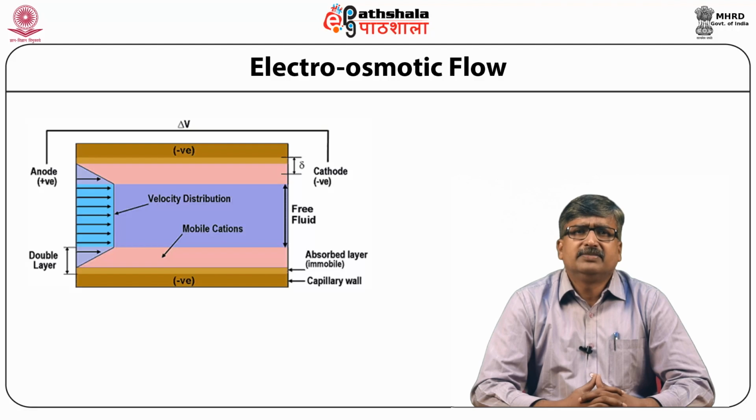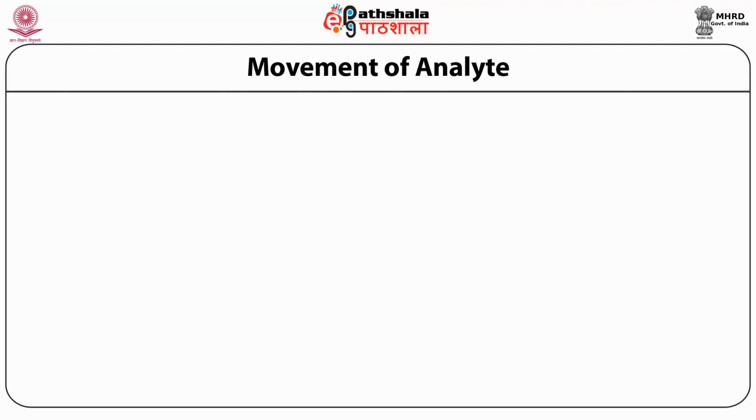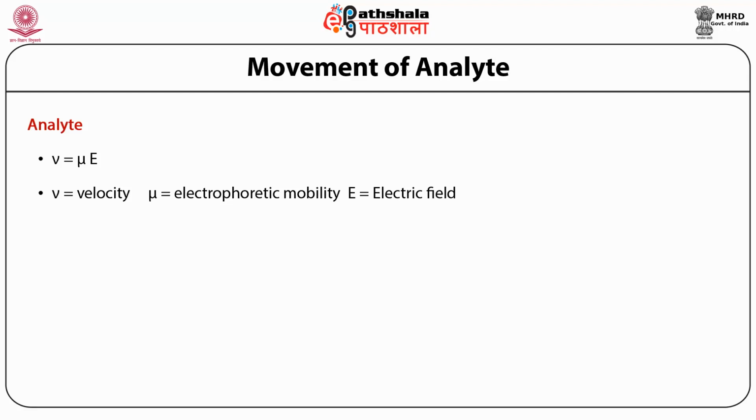Currently available commercial CE systems are equipped with capillary temperature control function and an autosampler in order to improve the reproducibility. The movement of analytes: separation by electrophoresis is based on differences in solute velocity in an electric field. The velocity of an ion can be given by v = μE, where v is the ion velocity, μ is the electrophoretic mobility, and E is the applied electric field.